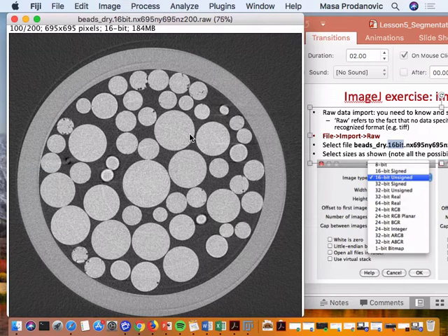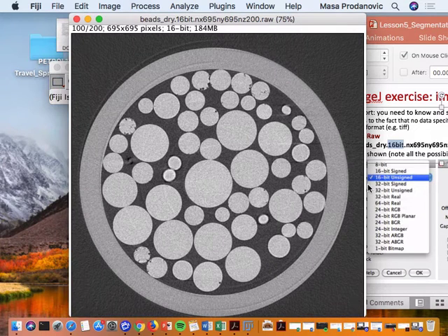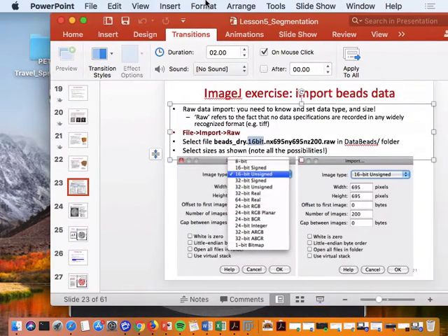This is microtomography. Somewhere on the order of 5 to 10 microns, I'm not entirely certain. You can see that I do have some imaging issues, possibly things moving here. And my beads are not completely perfect. Not on micron scale anyway. So no matter what, I will have a little bit of dots here, which might cause issues with my modeling and I might want to remove. Okay. But for now, did everybody import it? All right, let's go through the exercise.